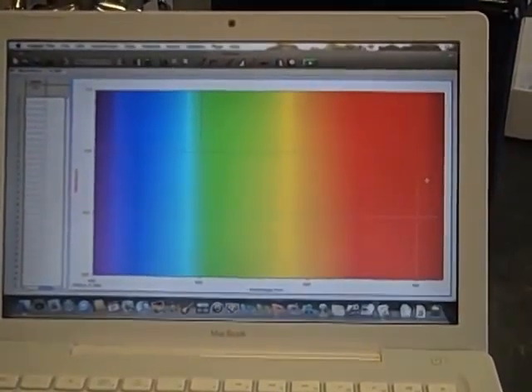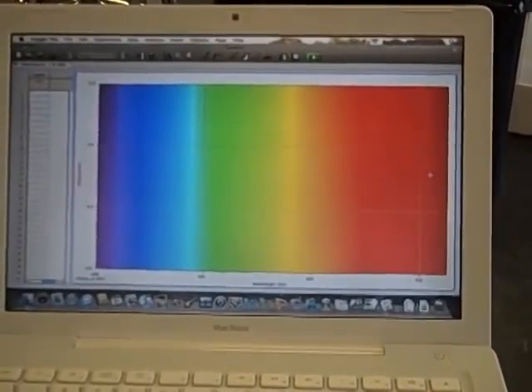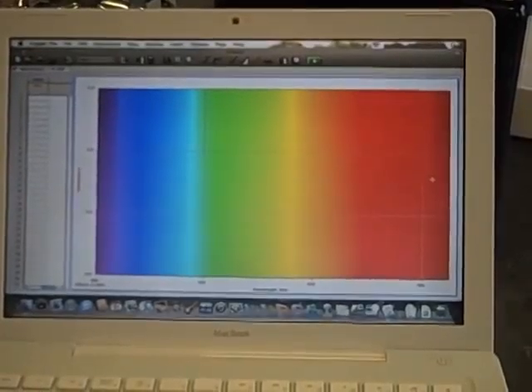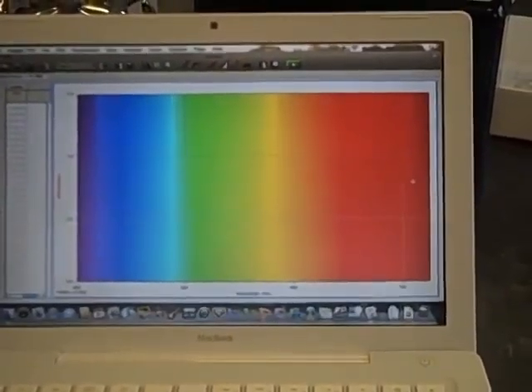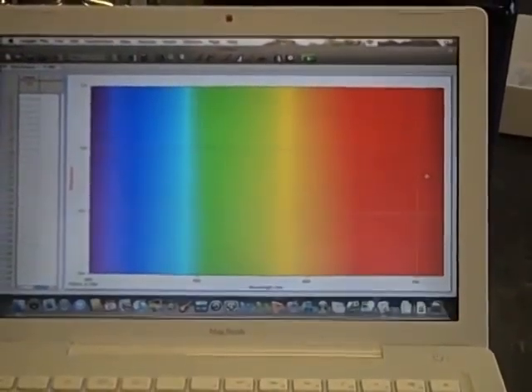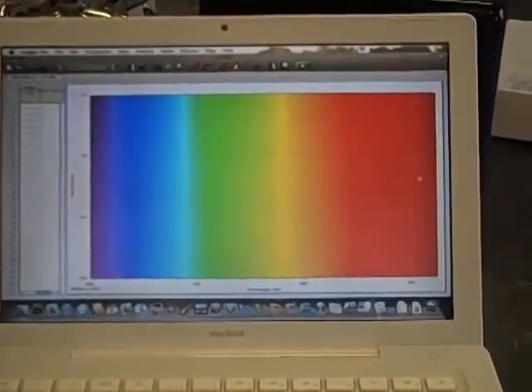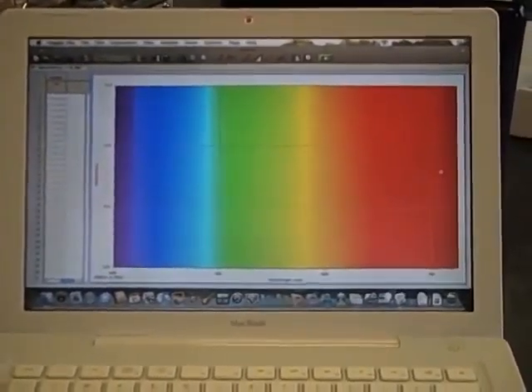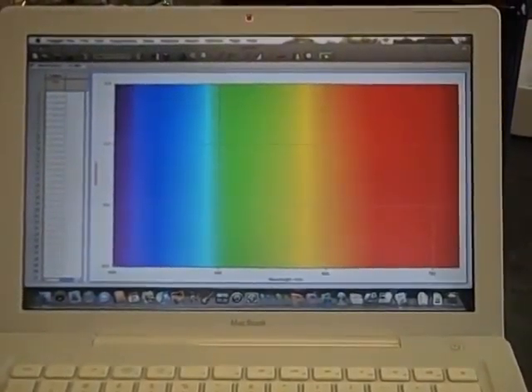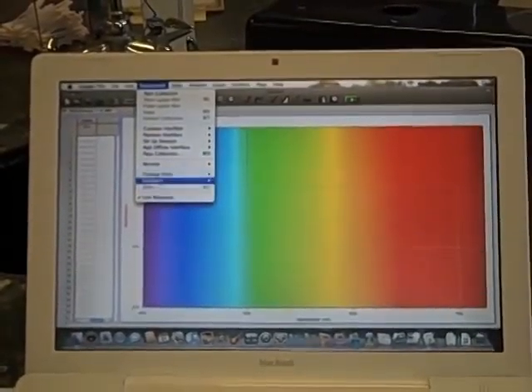And now we need to calibrate the spectrometer with our number 5. So I'll put that in the spectrometer. And Evan, is the number 5 pure water, or do you have a little of something in there? There is a little bit of the, I think it's the iron 3? Yes, the iron 3. You're right. Okay, good. So now from here we go to calibrate it, and that happens in the experiment section. Down to calibrate.